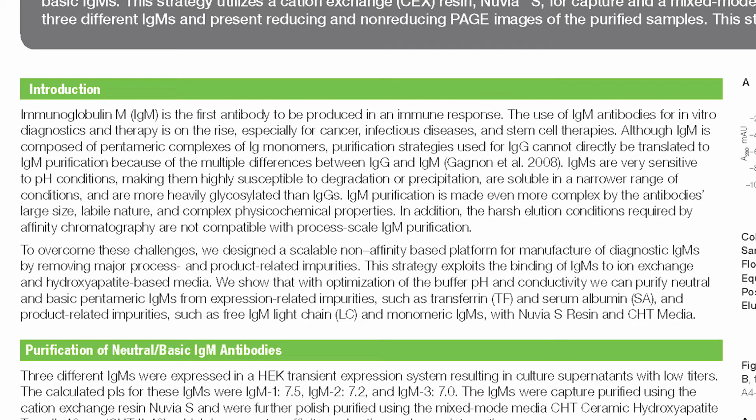On the other hand, they also have instability to low pH in some cases, so you can't go down with pH levels to values like 4 or even lower, and this also limits your ability for the purification.